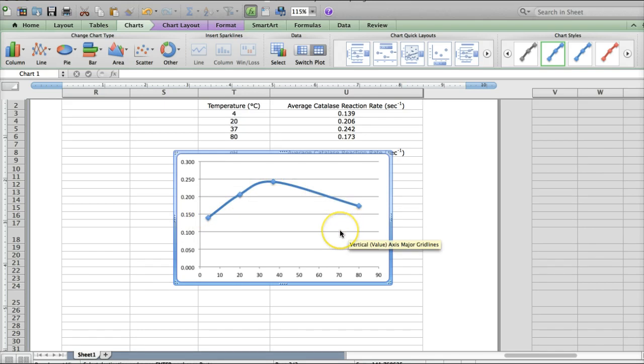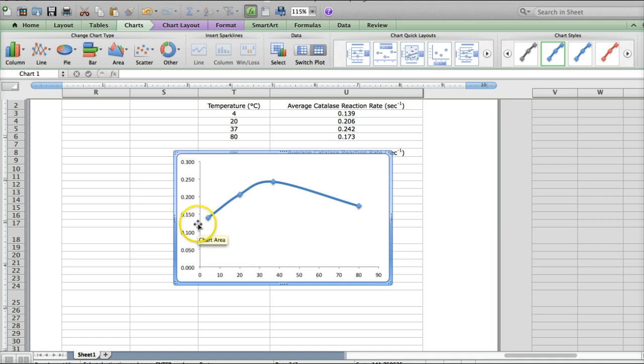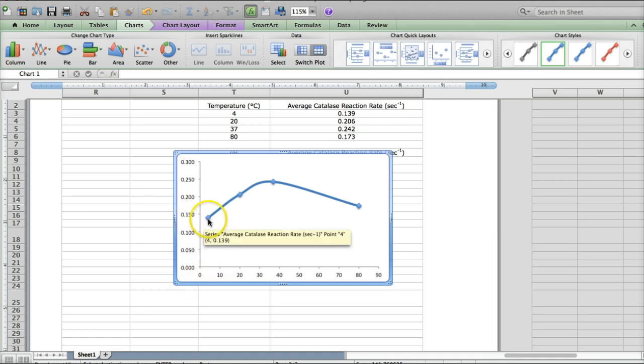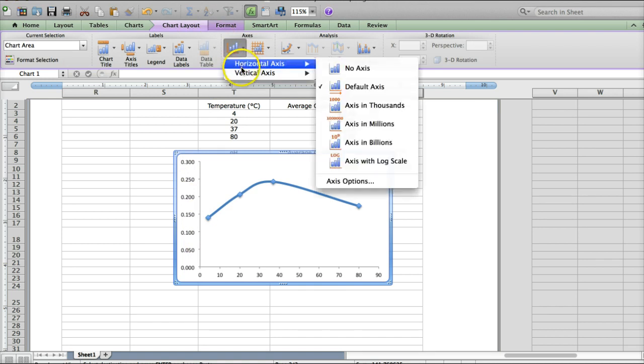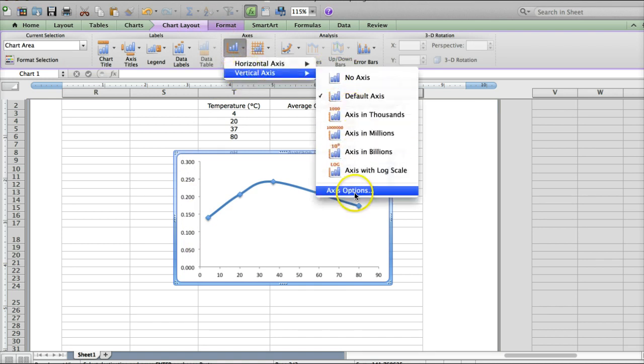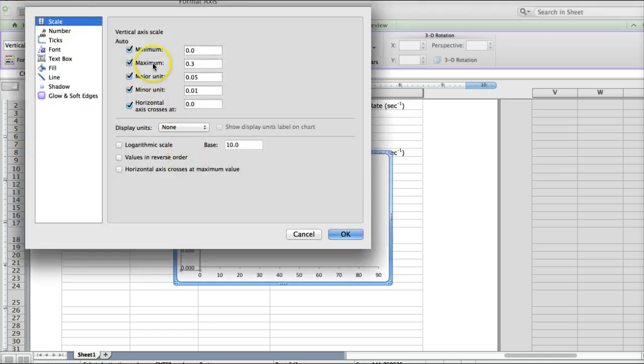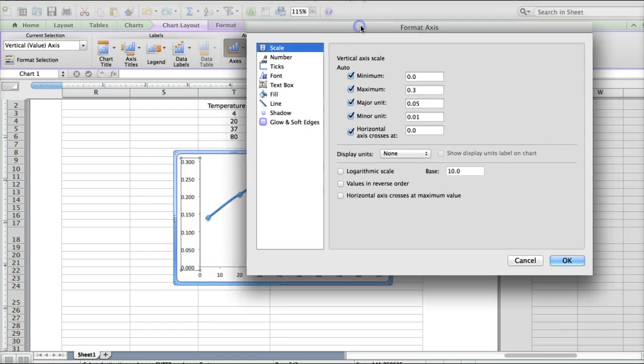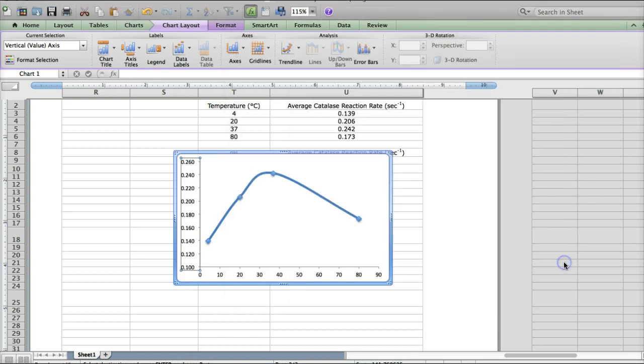We can get rid of the horizontal bars by clicking on them and clicking Delete or Backspace. The other thing we want to do, just to make the data as well-represented as possible, is to adjust the axis here so that it's starting closer to our minimum value. So I'm going to go up to Chart Layout, and I'm going to choose Axes, and we want to modify the vertical axis. Scroll down to Axis Options, select Axis Options, and we're going to make the minimum, instead of 0, we're going to make it 0.1. So you see how it changed there, and I'm going to click OK, which is great.